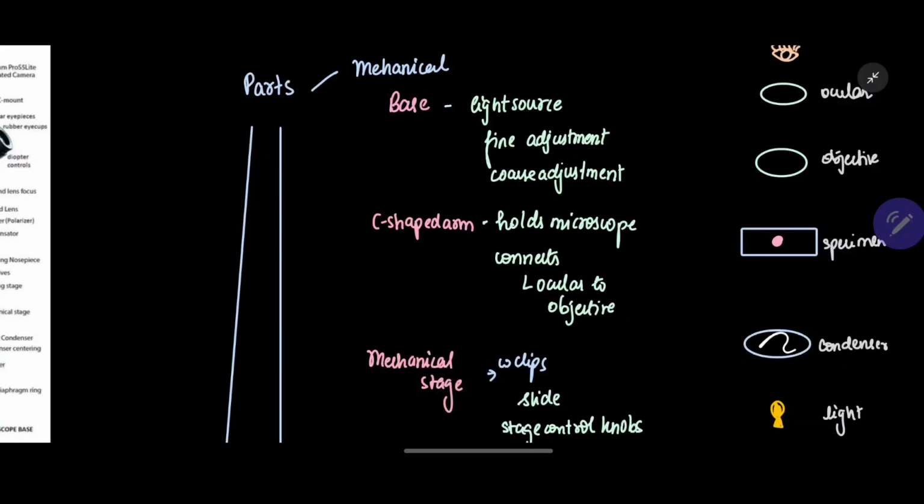Your light source is going to send your light to the condenser. Now, what's the job of your condenser? The job of the condenser is to condense that light. So this is going to send out light like this, and then your condenser is going to condense that light onto your specimen, something like this. Now your condenser is gathering all this light and focusing it on this specimen.